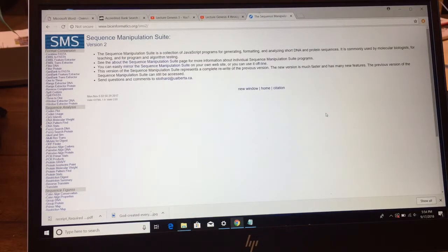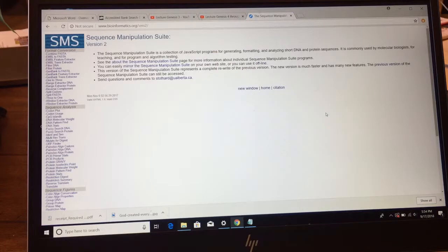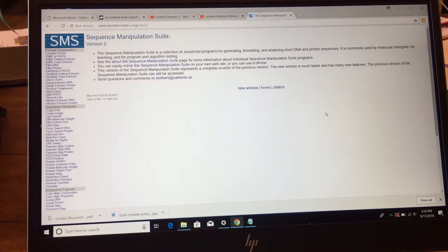What we're supposed to do, I think I'm going to pick up from Mary's. The first question is: compare each of Mary's alleles with the wild type coding sequence. Can you identify a mutation in either or both? I think my friend was able to already do that part, so I'm going to translate each of Mary's alleles. Number 2 is: translate each of Mary's alleles and compare them with the wild type amino acid sequence. What differences can you detect?